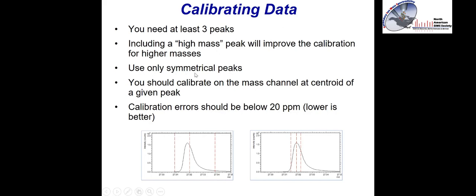If possible, I always recommend calibrating only on symmetrical peaks to avoid the issue I talked about in the previous slide. However, if all your peaks are asymmetrical because of either charging or something else, then you don't really have a choice.